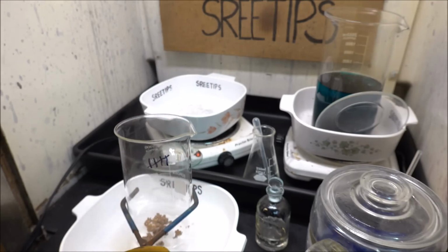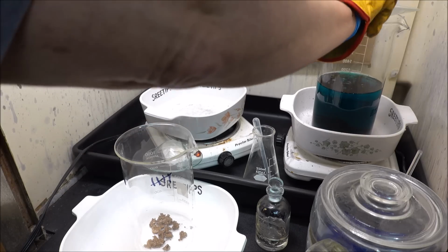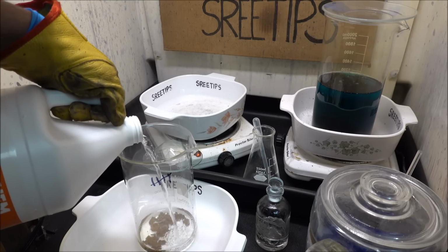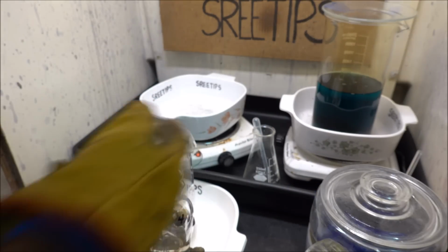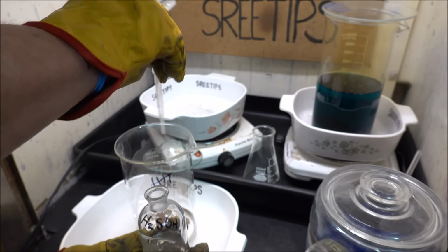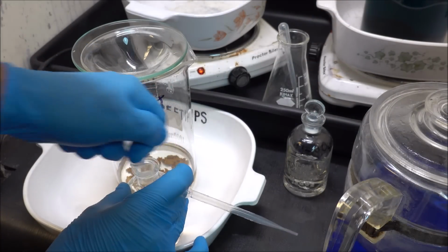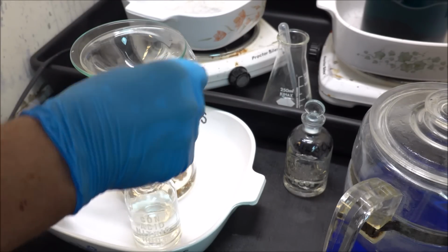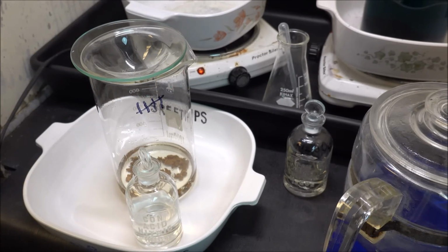And now what I'll do is add some hydrochloric acid to the gold here. Cover this up. About 100 milliliters of hydrochloric acid. And I'm gonna add some concentrated sulfuric acid here to precipitate out any lead that may have been present. I'm gonna add some concentrated nitric acid, about 6 milliliters. And we'll put this up on the heat and let this start dissolving.